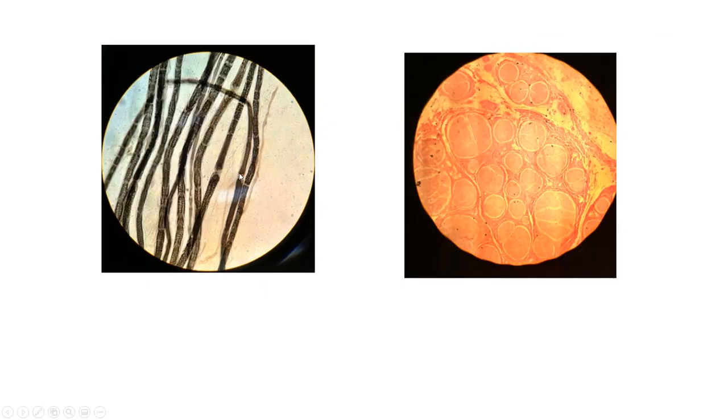We come here, and this is a microscope slide of axons of neurons. What you're looking at here, that light spot right there, and you can see one here too, those are nodes of Ranvier on axons. So you can see that it looks like little sections here. Those light spots would be the nodes of Ranvier. So these would be myelinated axons. And then this is just showing you cross sections of a peripheral nerve. So remember, a nerve is made up of a bunch of neurons. And so that's what you're seeing in here. So this entire thing would be a nerve, and you can see the little bundles, fascicles, of neurons inside it.